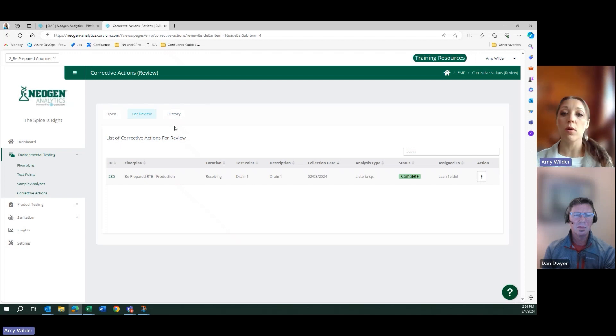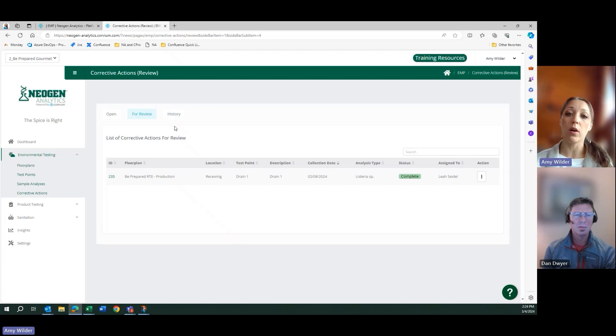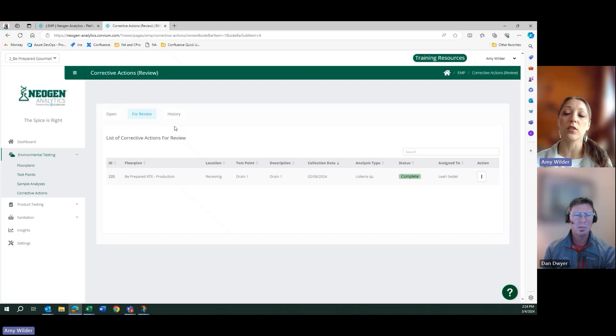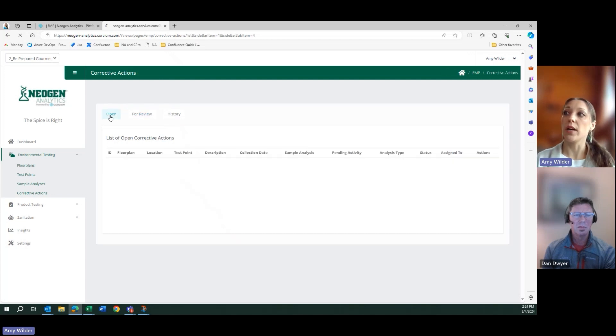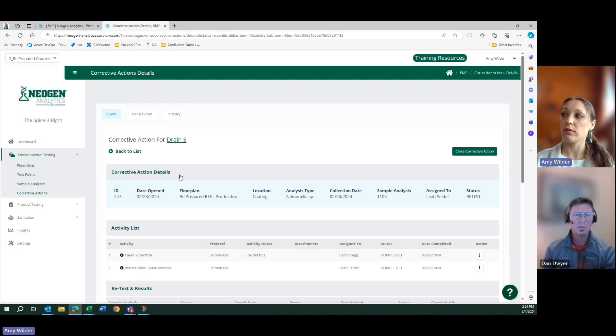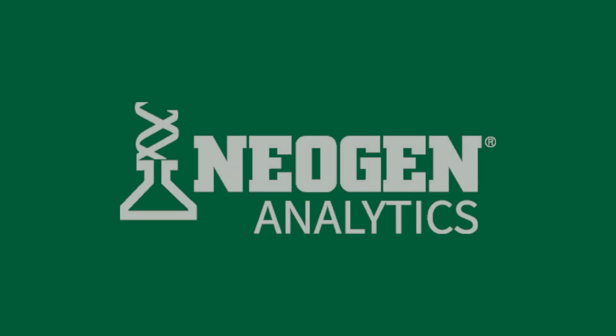So you don't need to know maybe what your policy states, what all the activities are, how many retests the software will tell them upon opening up each and every corrective action.